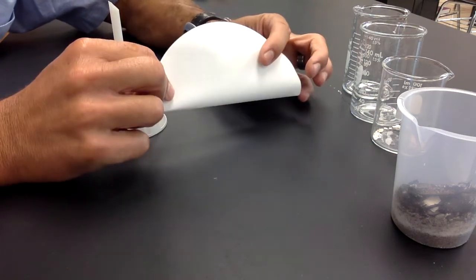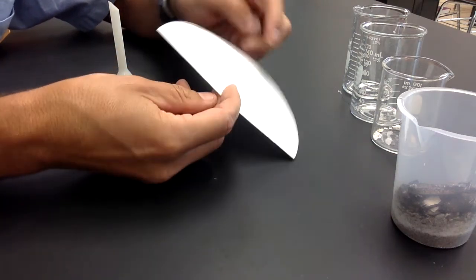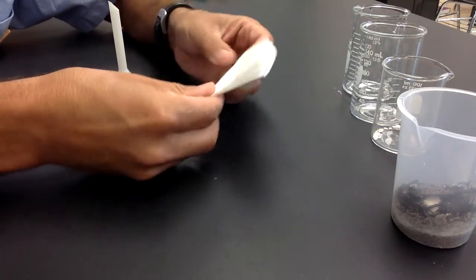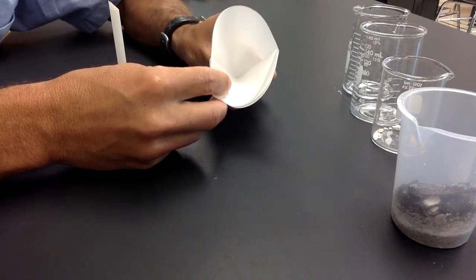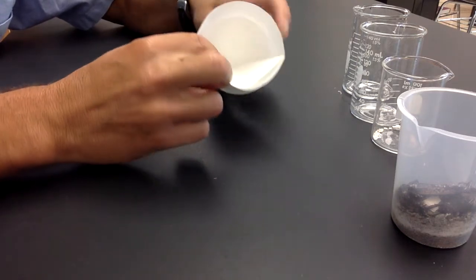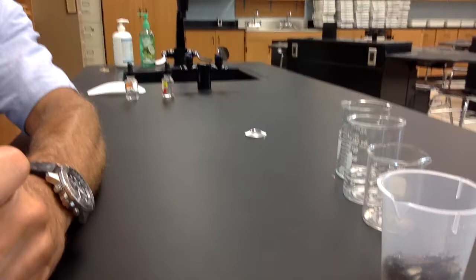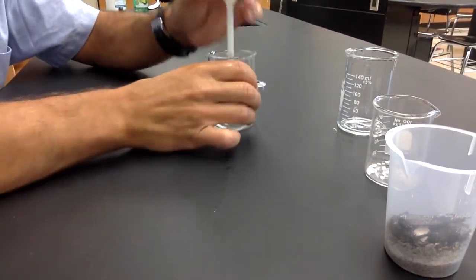You're going to take one of these filters, fold it in half, and then fold it again in half to make it into quarters. Then you're going to open up one section right here as a cone, put it into the funnel, and then from here you can pour from one beaker into another.